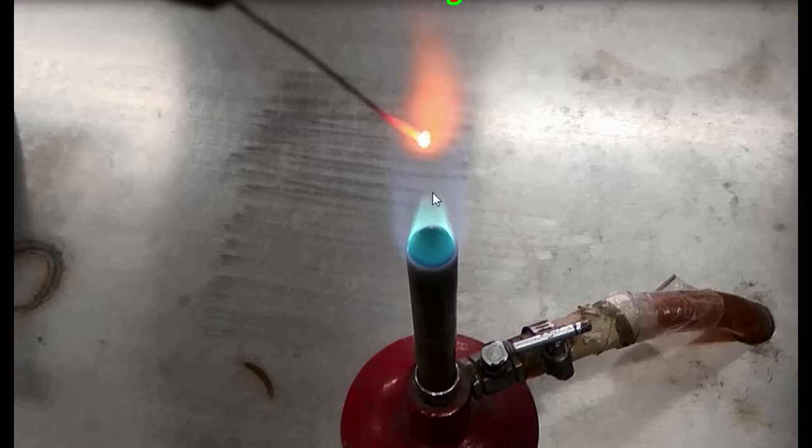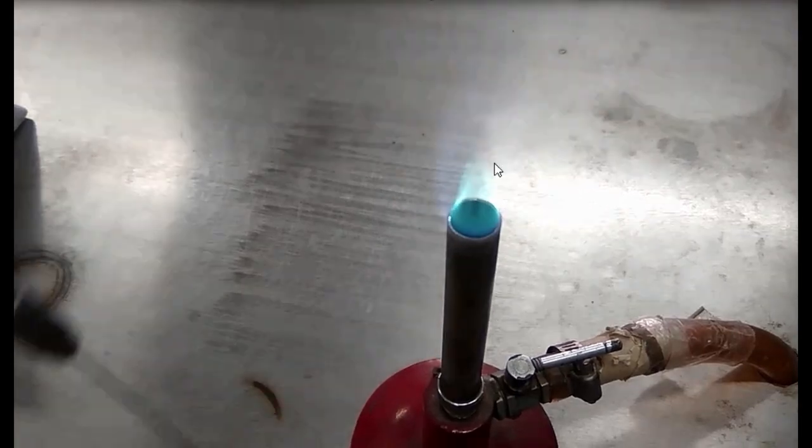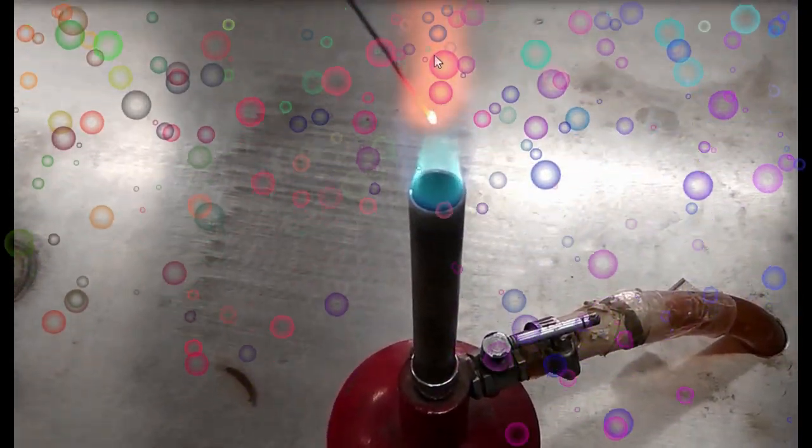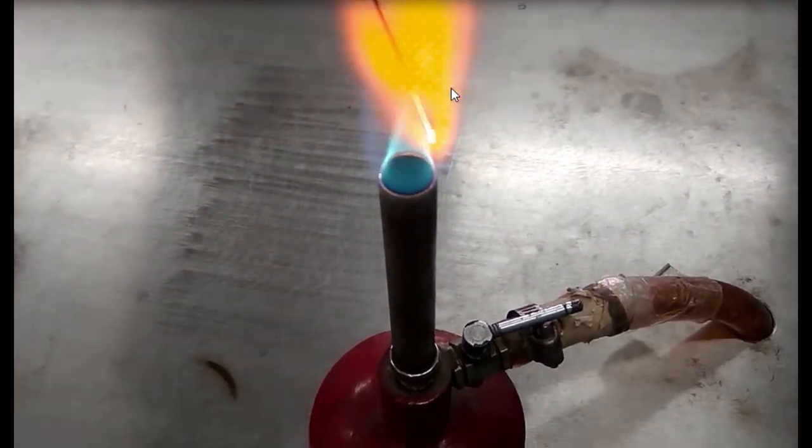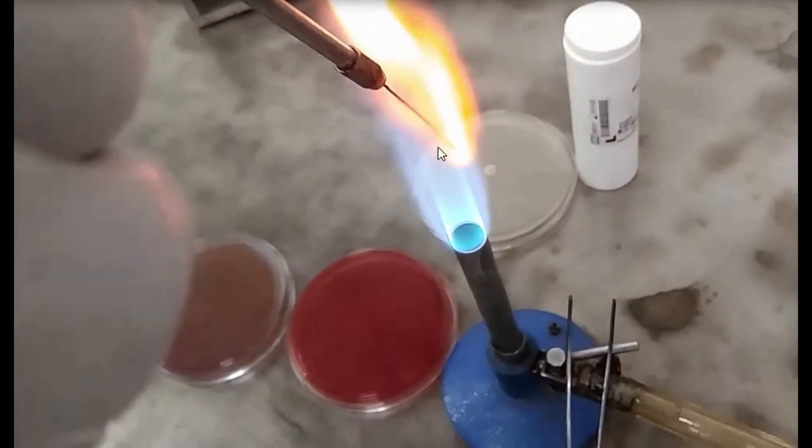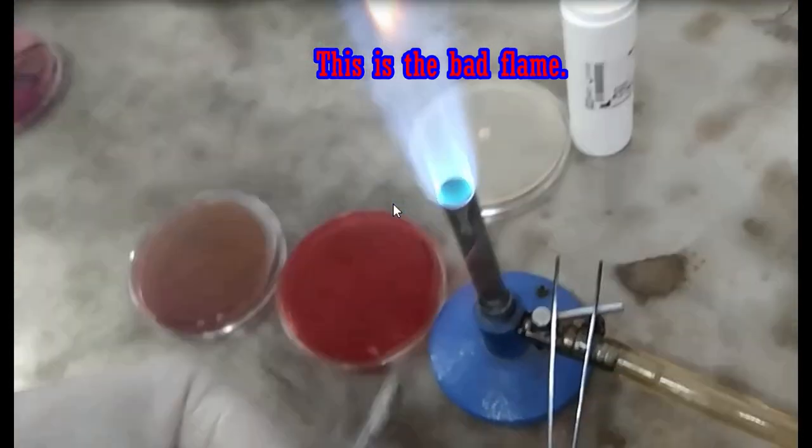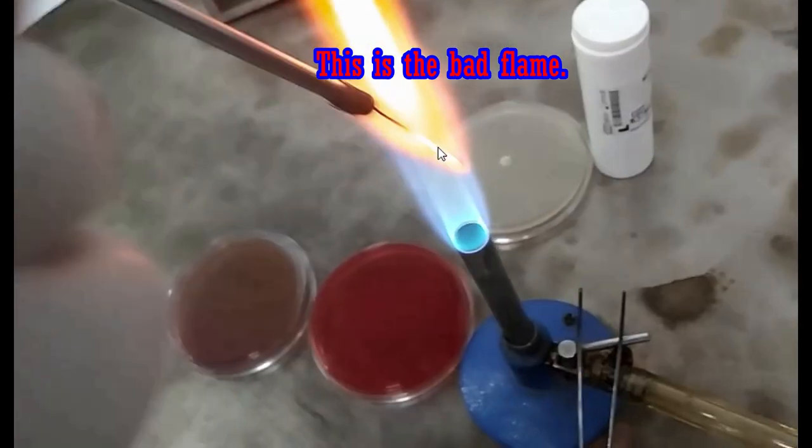This type of blue coloration flame is an indicator of good flame. In simple terms, a mixture of yellow color in the flame is an indicator of bad flame.